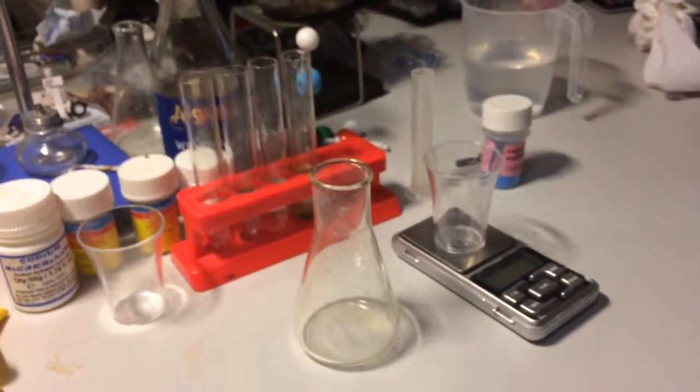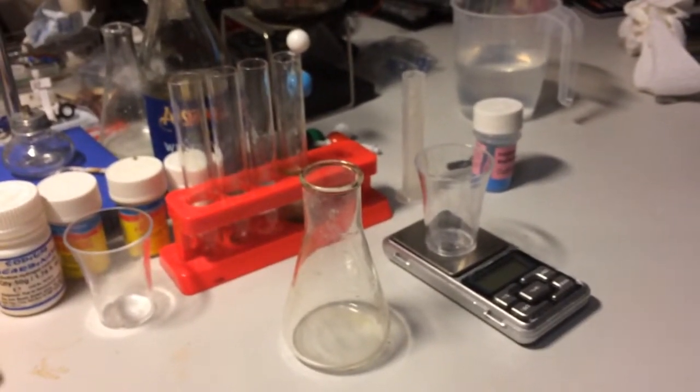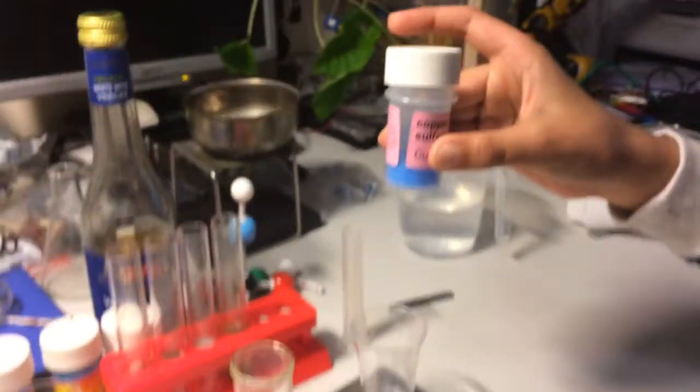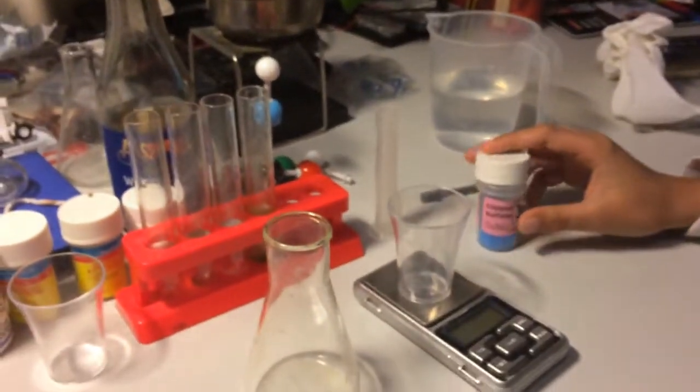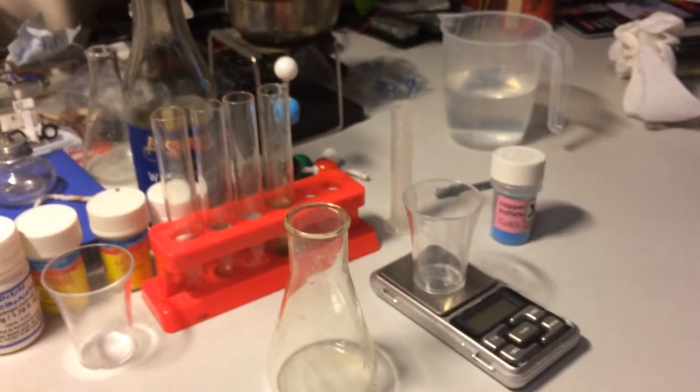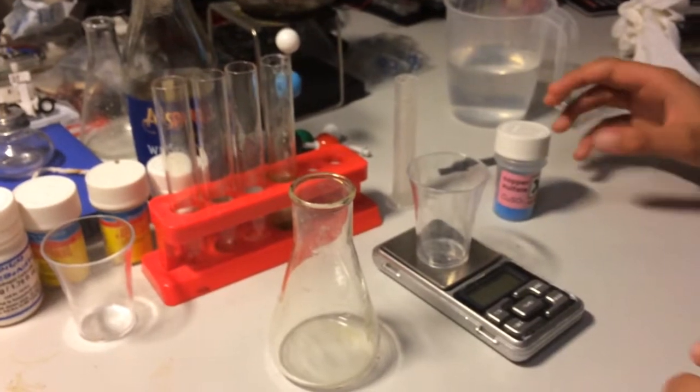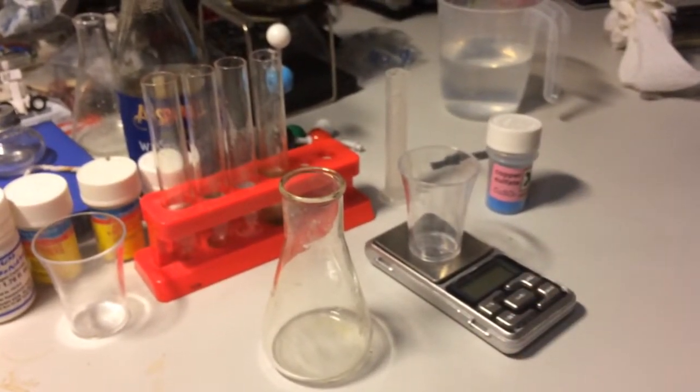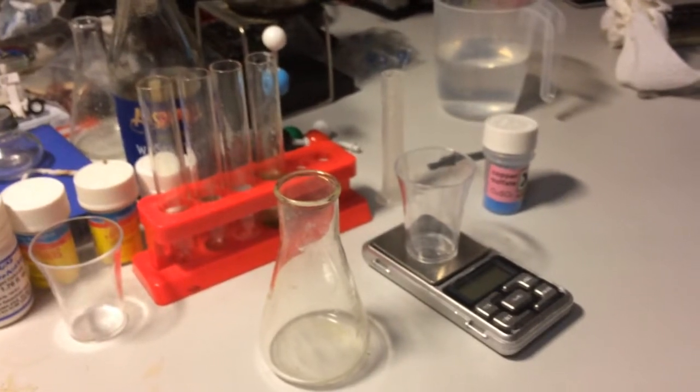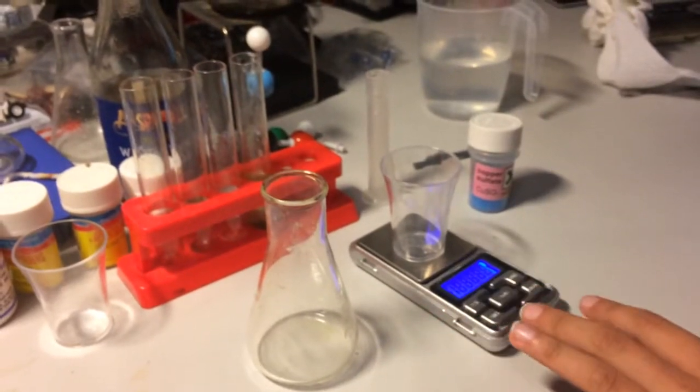To do this, we'll first need a solution of copper sulphate, and we'll mix the copper sulphate in 10 milliliters of water. Firstly, we'll need to measure the amount of copper sulphate we will need, which in this case is 2 grams.